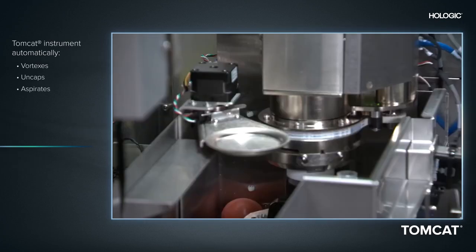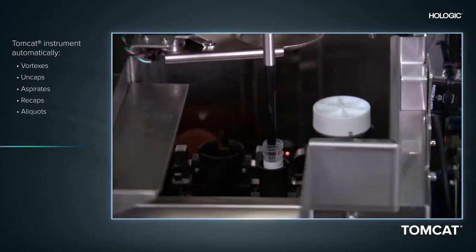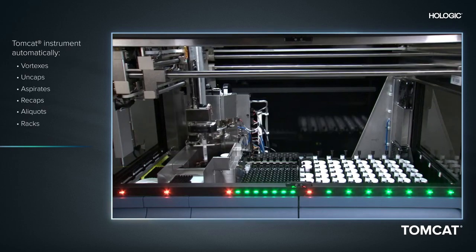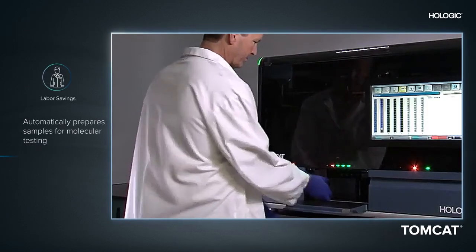The system then removes an aliquot, recaps the sample vial, and places the aliquot into the secondary sample tube. The tube is then recapped and placed into the output rack, ready for molecular testing.